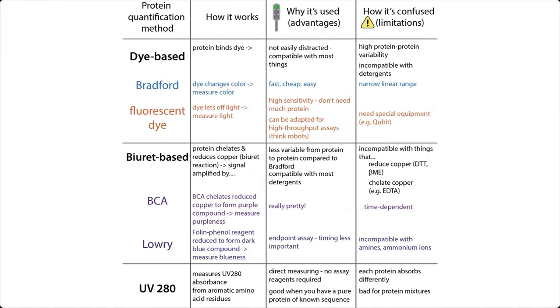Another method is a Bradford assay. These different protein assays, ways to quantify how much protein you have, all have their pros and cons. But today we're going to focus on this UV-based method.